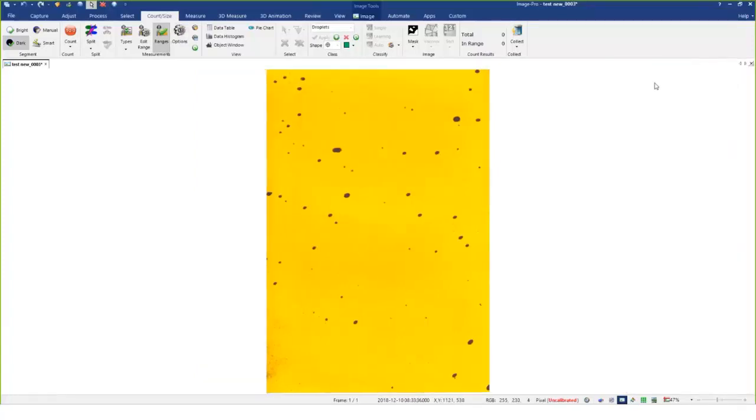In addition, it will save how the data table is set up, and also whatever naming convention you use. Most important thing you can do, save that file. Then we record that in a macro. Then it makes it very simple, and then it's easy to also feed into a batch process. It's nothing more of setting everything up. And I'll just do, and this is the reset button I mentioned. Puts everything back to the factory default state.